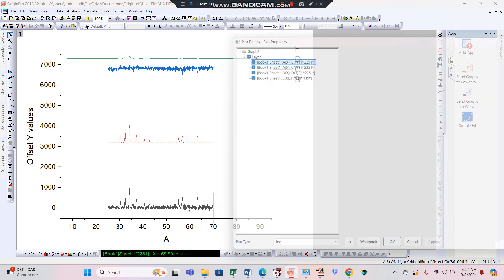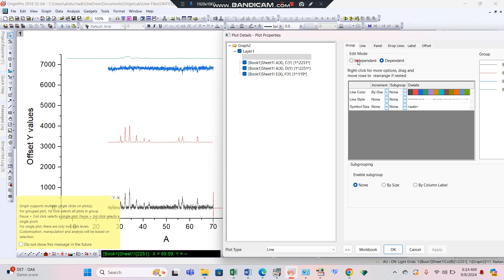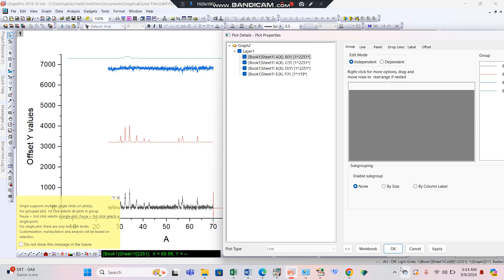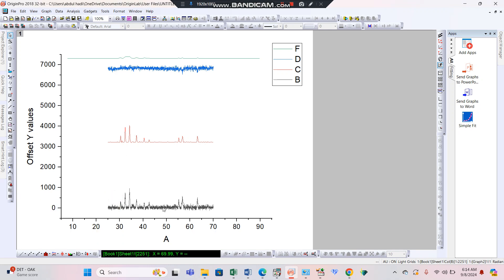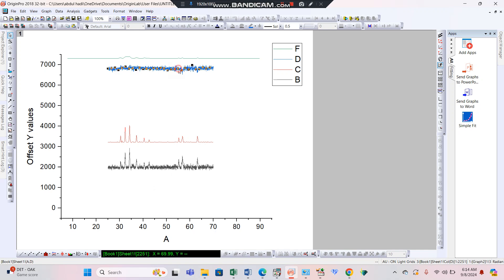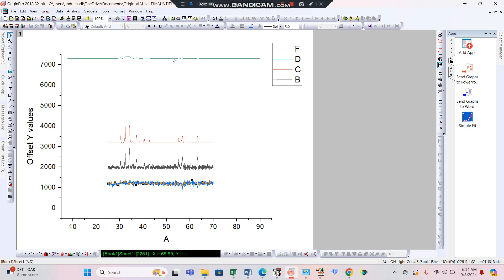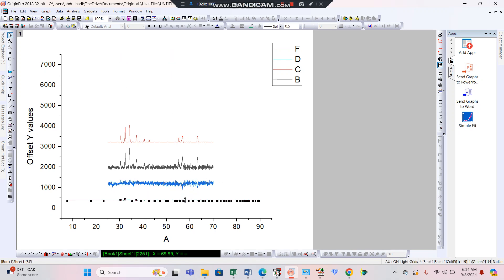Double-click and make all these lines independent. By selecting independent, all these graphs become independent and can be moved as needed. The subtraction difference is here and this is the JCPD card symbol. Double-click the JCPD card values to inspect them.